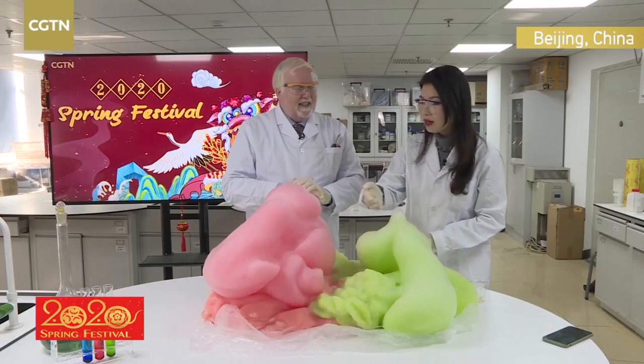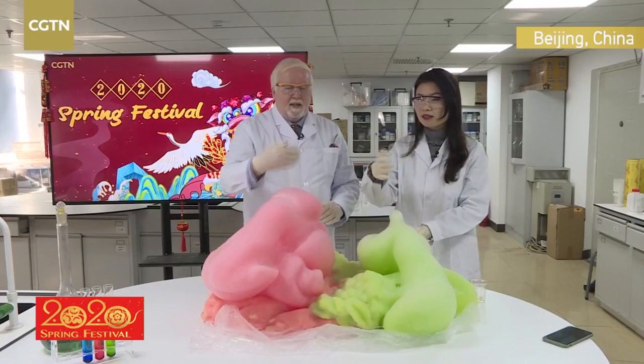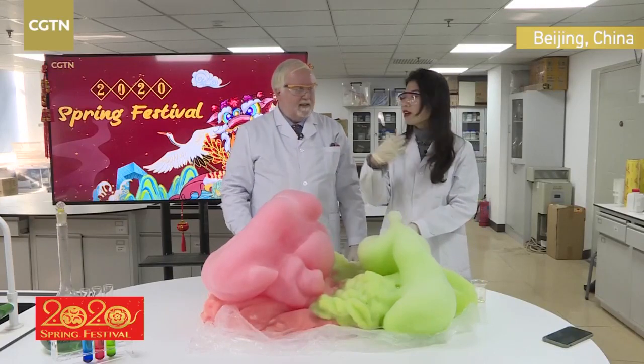But guys, you see when I smell this? Yeah, I use my hand. Absolutely. You don't smell like this. That's the expert chemist's way, yes. I'm an expert chemist now.